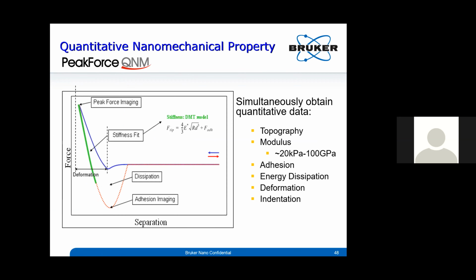And then there's PeakForce QNM. This is a mode on the Icon. It is not on the Edge. In fact, I probably should have labeled the slide that. But it basically takes that force curve and does an analysis like we described and gets images out of it.